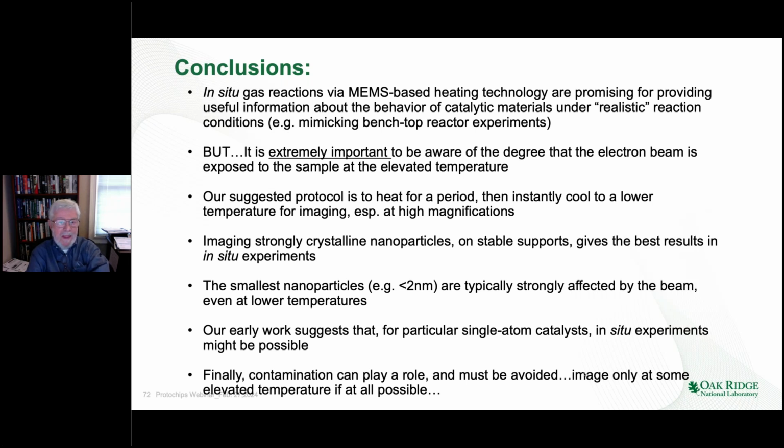So just to finish the conclusions, lots of interesting things that can be done with this heating technology. I'll leave this up for just a second. And early work suggests, I just mentioned, particularly for single atom catalyst in situ experiments might be possible. So the contamination is always a problem. I haven't discussed that. Image only at some elevated temperature, if at all possible.